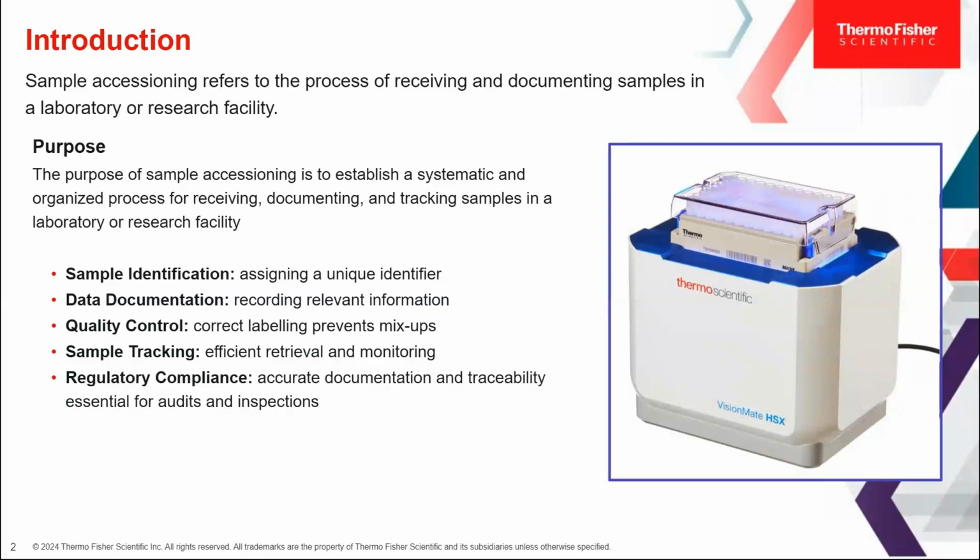Then we also have a quality control component. So when you implement these protocols, they help to maintain a certain quality control by ensuring that samples are properly labeled, handled, and stored, and it prevents mix-up of samples and any kind of errors that could happen during the process.